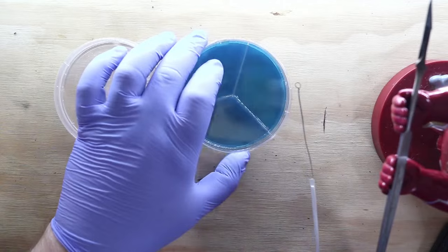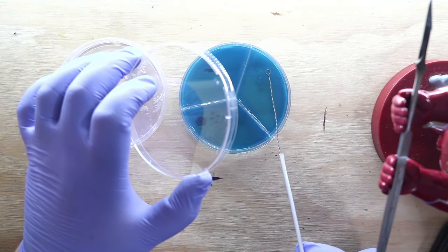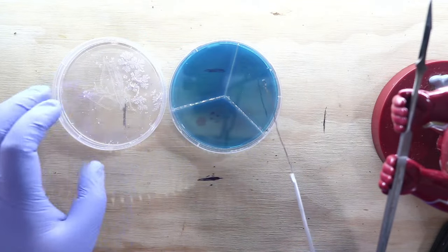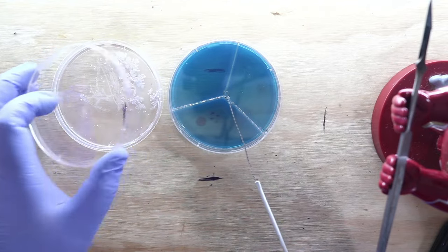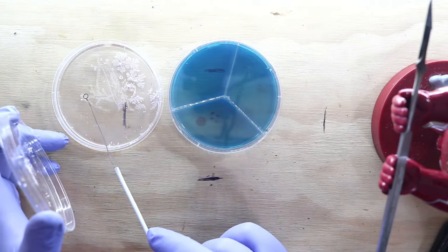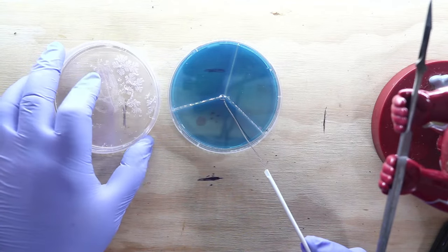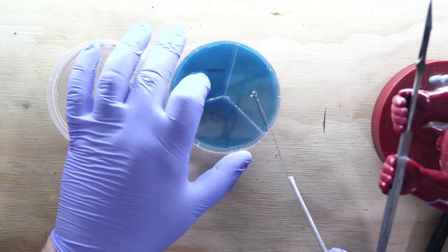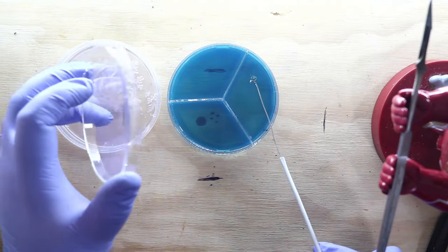Flame sterilize. Cool. In the agar. And now it's got a little bit of agar on it. It's glistening. It's a little sticky. So I'm going to come over here and I'm going to grab some spores. And oh my gosh, I don't know if you guys can see them. Can they see them? Yeah. Okay. Yeah, that's a lot of spores. I probably won't have to do very many. I probably won't even have to scoop again.